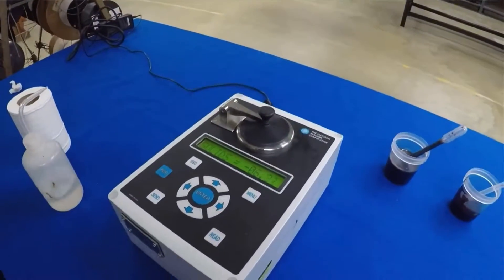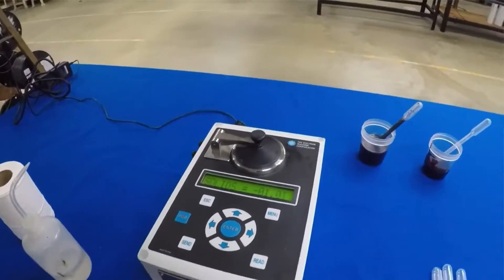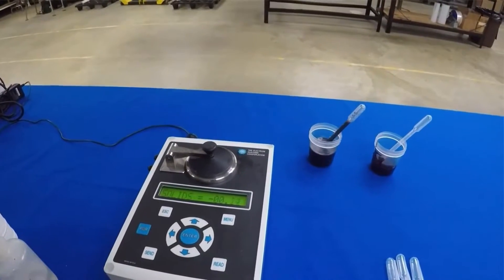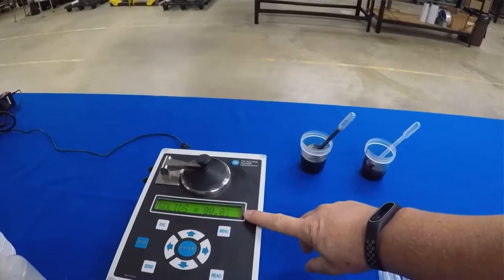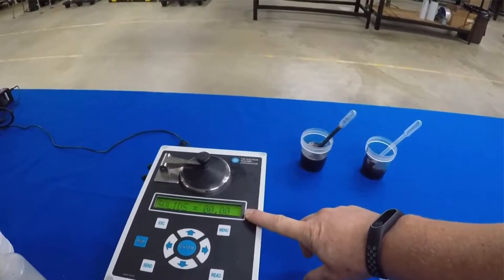We've put some water on there and we're going to confirm that this thing reads water — which you would expect to see basically zero. So after you've taken a water sample and confirmed that the unit is reading correctly on water, your next step is to use your black liquor samples.